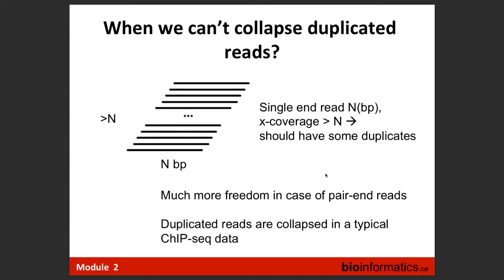I think there was either Sambamba or SAMtools, and there was a command like remove duplicates. But I think it's still, we can double check. Yeah, in SAMtools, for sure, it's just collapsing. So taking one copy.